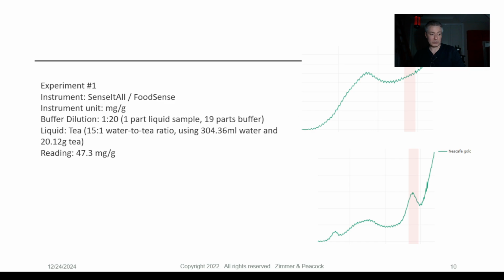I'm not trying to make everyone an analytical scientist or an electroanalytical scientist. I just do it because in the food and beverage industry, it's actually easier to make a glucose strip because blood is less variable. But green tea, black tea, not that I'm an expert on teas, but coffees, etc. These are complex samples, and so sometimes we need to see the raw signal to really understand what is actually going on in there. Now they've also got a beverage and an energy drink signal as well.